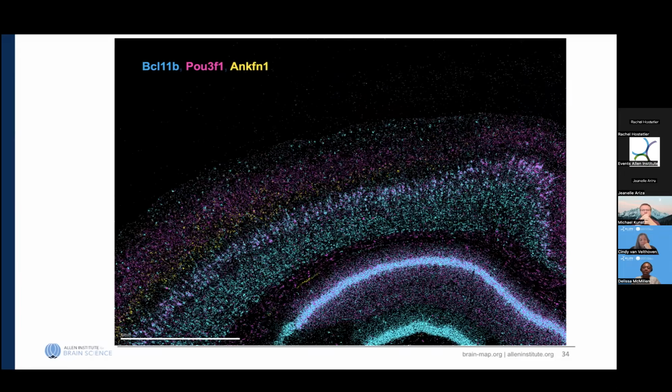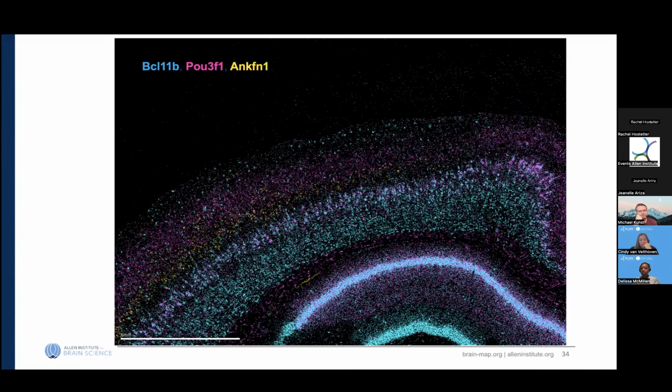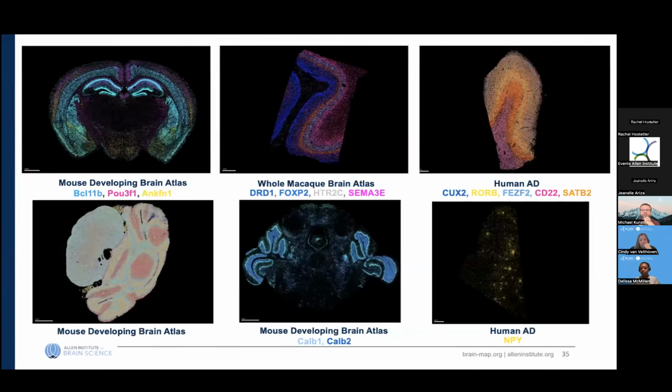As well as looking at the laminar markers, I then compared the laminar markers we were given to the ISH atlas of the same genes to make sure that we were getting them in the right positioning. And then once we did that, we were able to say, okay, we know that those genes are in the right position. We could then move forward.